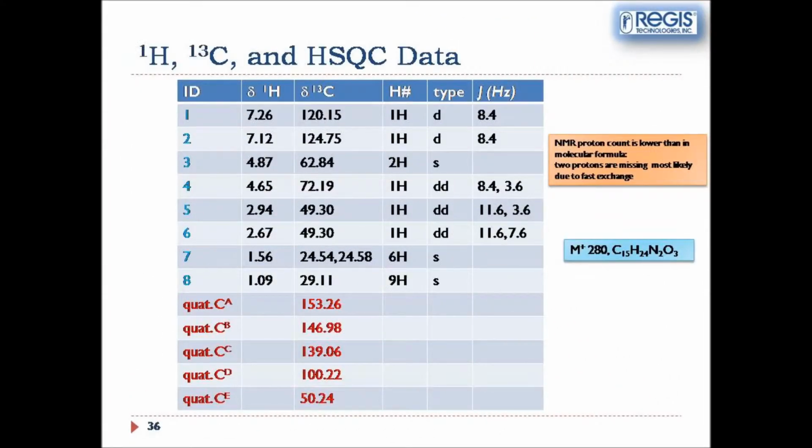When we finish analysis of HSQC data, we have the table filled, which shows that again NMR data is seemingly missing two protons.